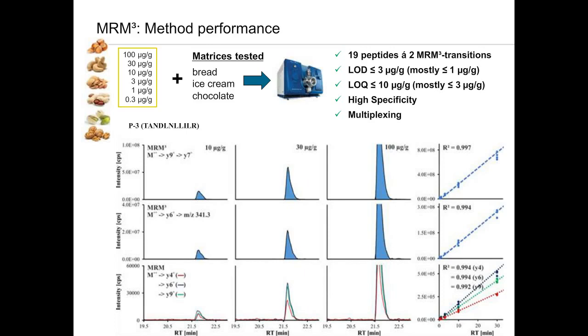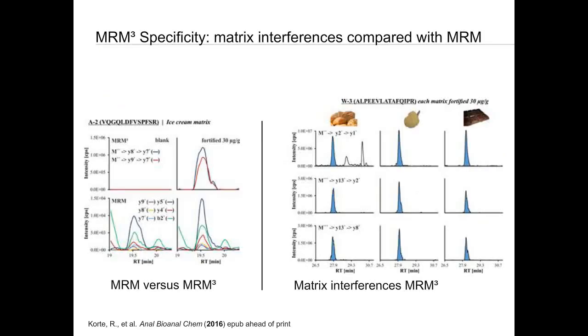We also started a project on identification of Crustacea, and this is somehow a link between allergen detection and species authentication, because these marine foods are prone to food fraud as they are rather costly, and in addition have major allergens. So again, you have both aspects, authenticity and food safety, for the Crustacea.